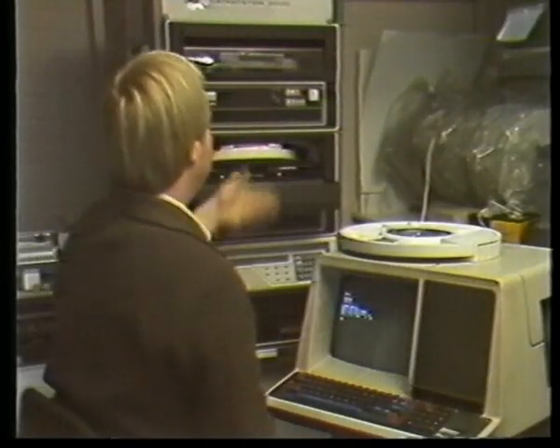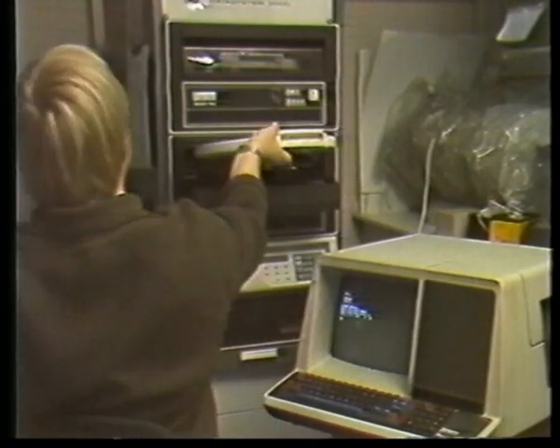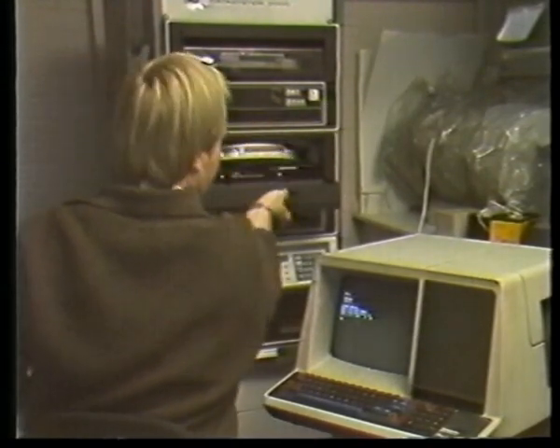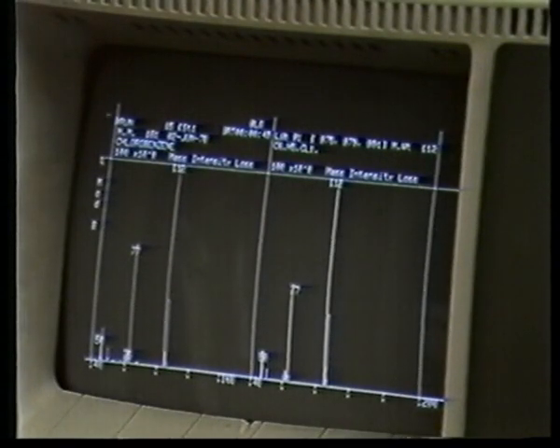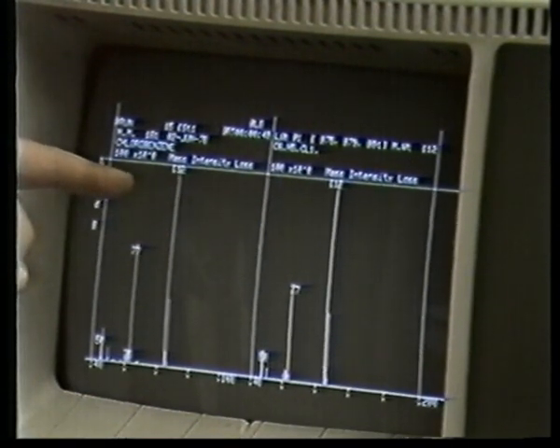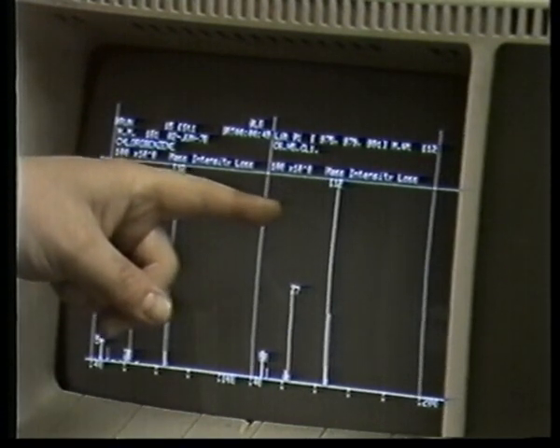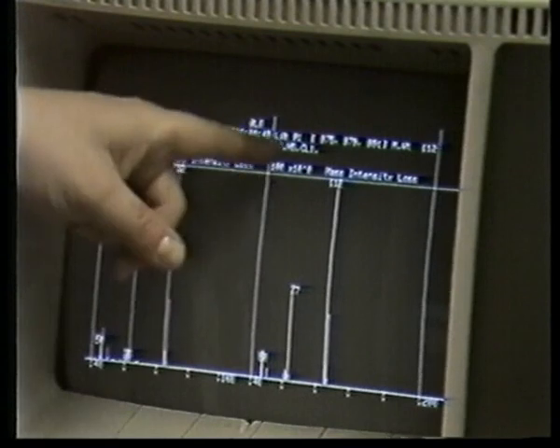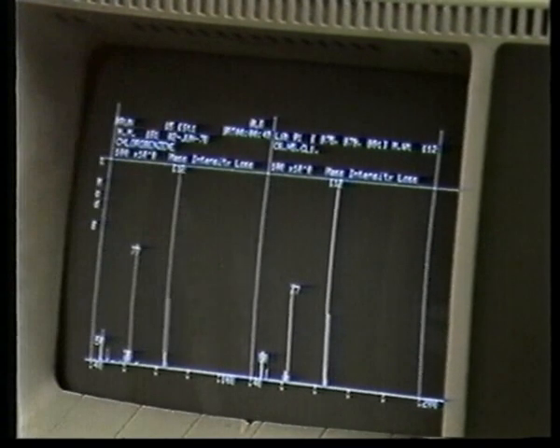It's possible to compare the output pattern with those of known compounds, which are kept in the computer's library, held on a computer disk. In this case, the spectrum of chlorobenzene is displayed on the left, and that of our sample on the right. The pattern is virtually identical. So, the substance we have been dealing with is now identified. It is chlorobenzene.